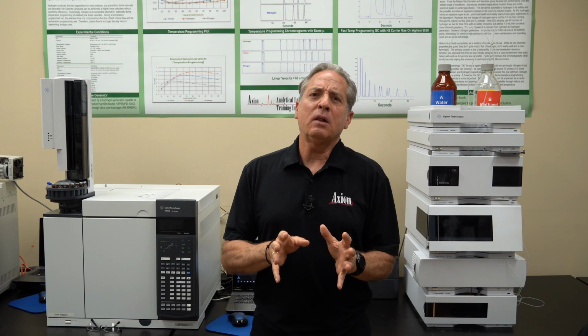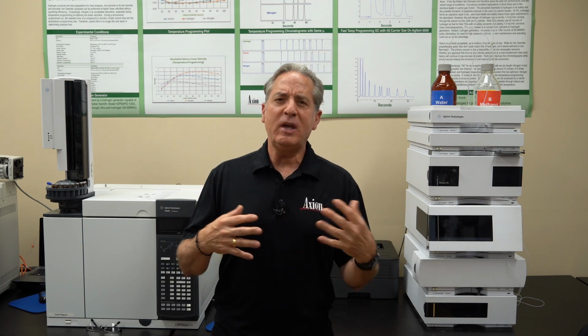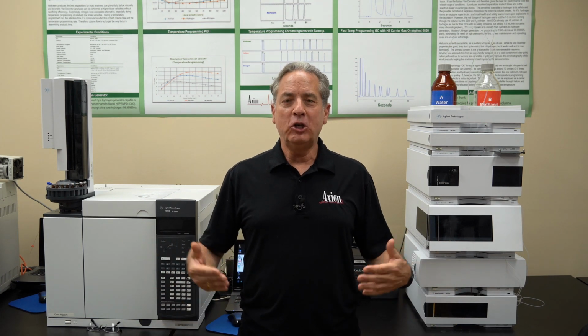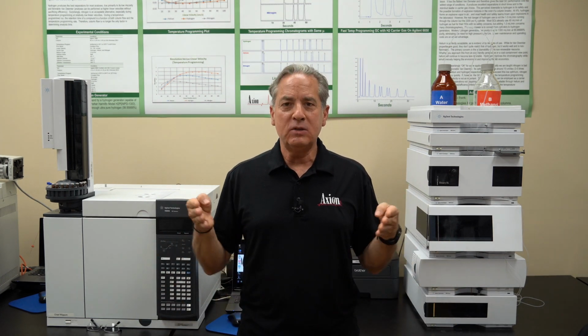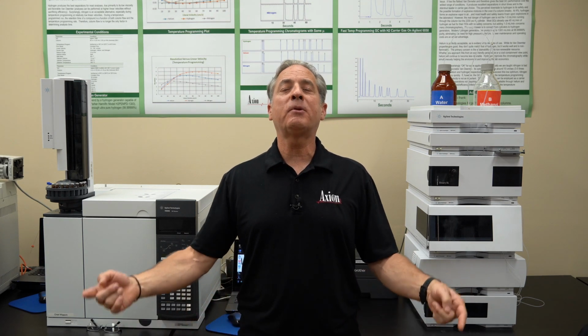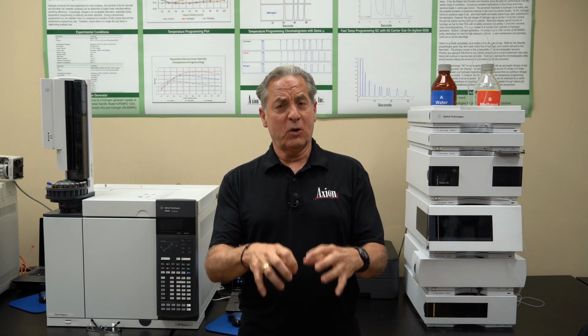Then we'll play around with changing from helium to hydrogen. You've heard about it, you've talked about it, let's actually do it. So you're going to do a run on an instrument using helium, we're going to flip a switch, you're going to do the same run using hydrogen, then you're going to optimize it for hydrogen during the class.